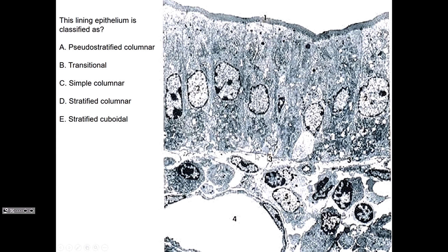Okay? People look a bit confused. Is this tough? Okay? Do you think you know the answer? Simple columnar. Does anybody want to ask me why it isn't one of the other ones? Why it isn't something else? Yes? You need to speak up. They're microvilli.